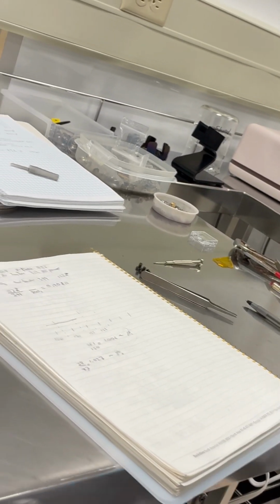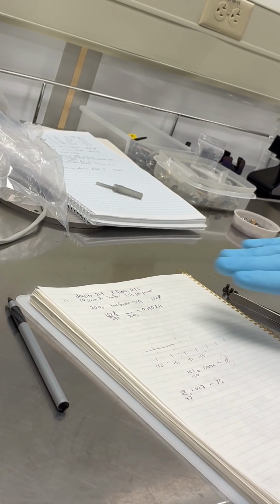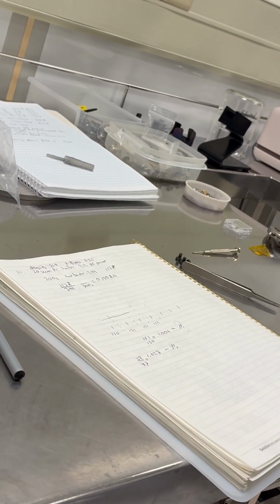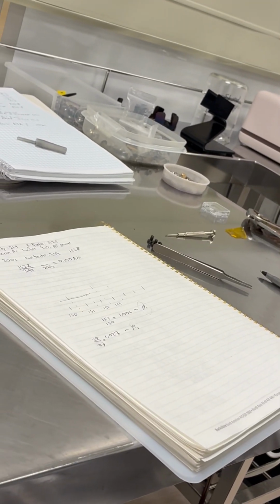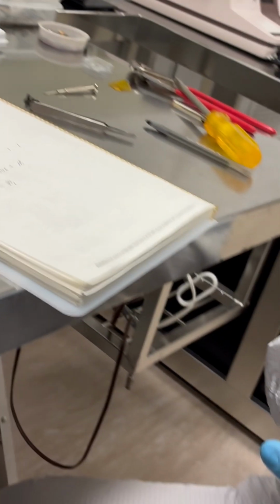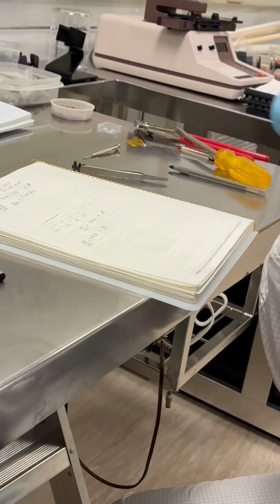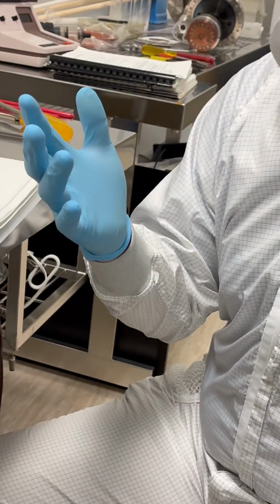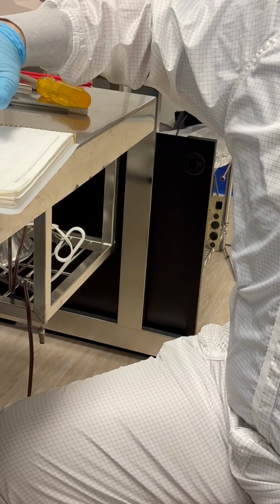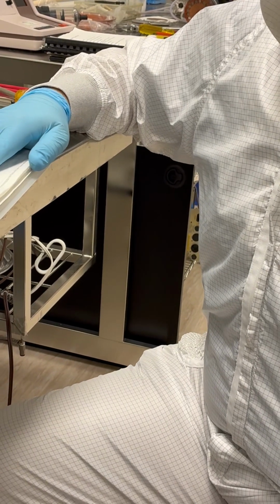And so if you really cared about the actual thickness of your sample within a few percent, you're going to want to take this number, grow however thick a sample you need, and go to a different measurement technique. Maybe profilometry, where you'll have to grow a couple hundred nanometers. Maybe if you use AFM, you'll have to grow about 10 nanometers. And you'll use AFM to measure your actual thickness, and you'll calibrate it, right? You'll say, oh no, the growth rate's not actually 0.190, it's 0.2 or 0.18 or something.